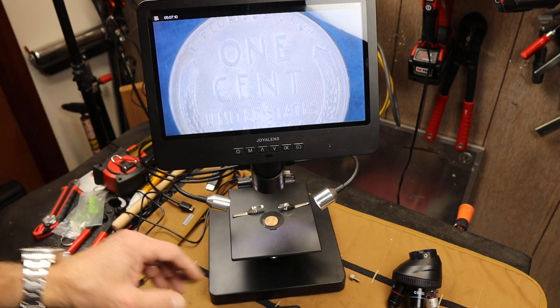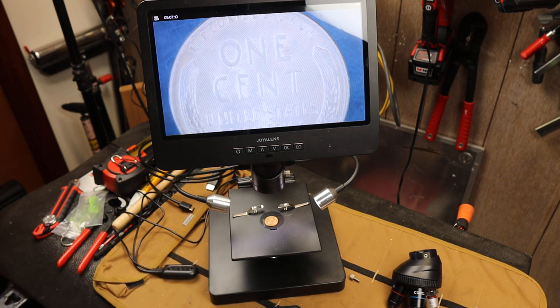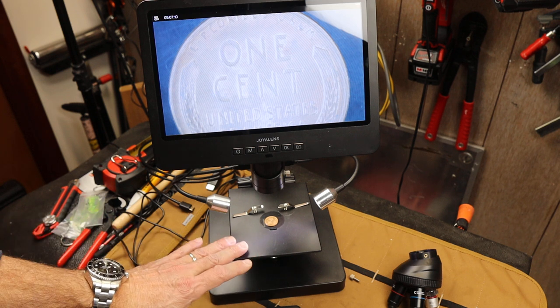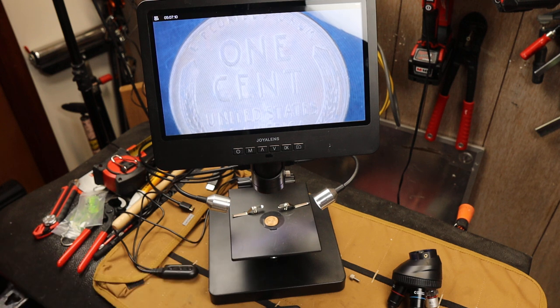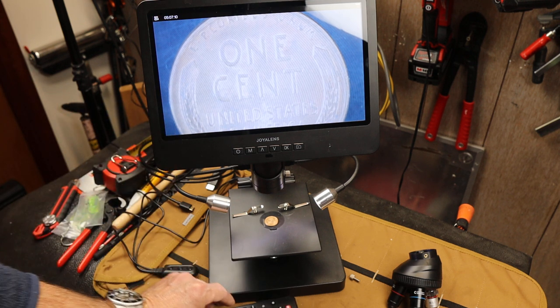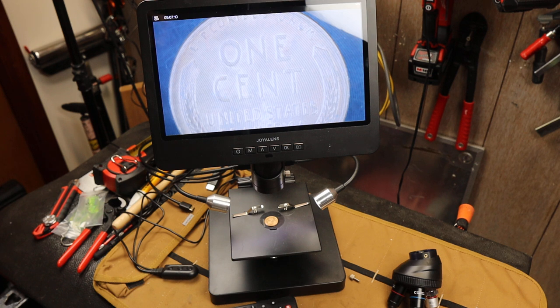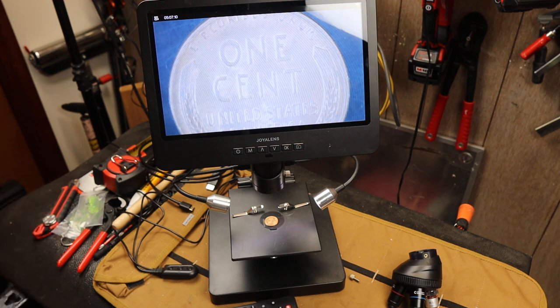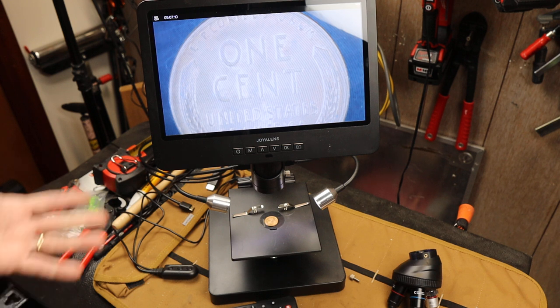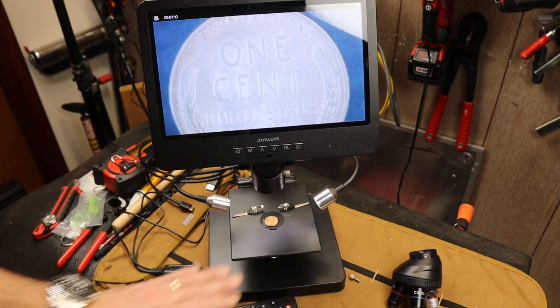But otherwise, what we've got is an amazing ability to magnify things. It has a couple of different lenses, as I pointed out, so you can shoot from about 18x all the way up to, theoretically, using the digital zoom, about 4000x. I think that's more theory than possible, but your mileage may vary depending on what you're doing.